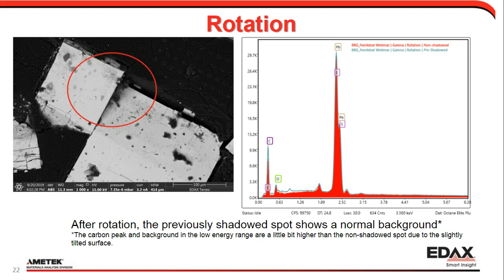When X-rays pass through material, there is a probability of the X-rays being absorbed. And whenever an X-ray is being absorbed, there's a chance of those knocking out a core shell electron, and we create a new X-ray. Basically, we have a conversion of a high-energy X-ray to a low-energy X-ray, which is X-ray fluorescence. So we can lose some of the high-energy stuff and gain some of the low-energy stuff. In this case, we see all of these are scaled to the lead sulfide, so we won't see the reduction, but we see we get an additional gain of carbon and oxygen.